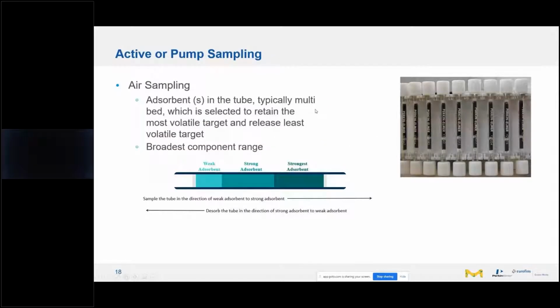Now I want to discuss the recipe again. Jamie Brown optimized his tube recipe for the analysis of terpenes. It's so flexible, thermal desorption. A lot of times you could get what you want, but omit what you don't want. There's many advantages, but let's talk about how it works.